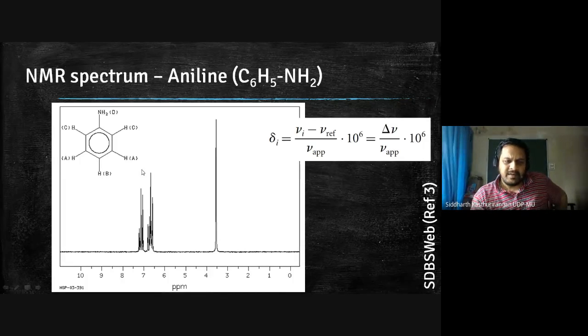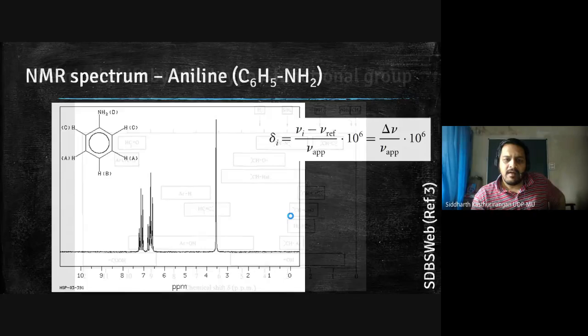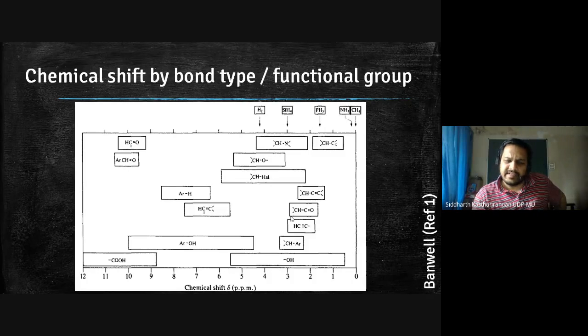But basically the idea in NMR is that it will tell you if different protons are there in different types of surroundings. And there are ready-made tables of that also available. When you have a halogen, then the chemical shift will be between 6 and 2. Whenever you have an aromatic with a phenolic kind of component, it will be between 5 and 10.